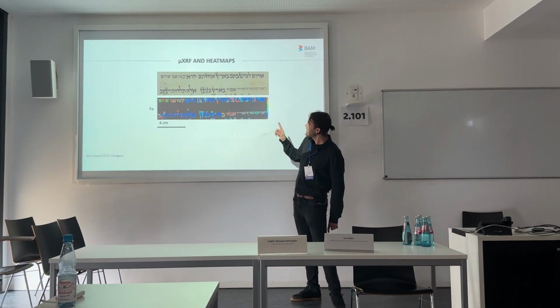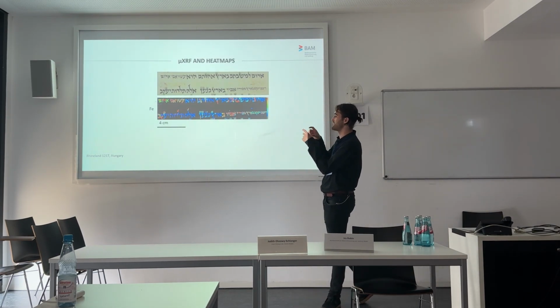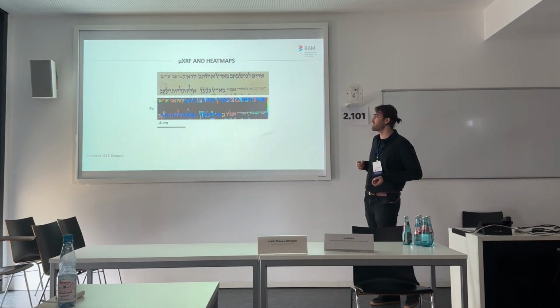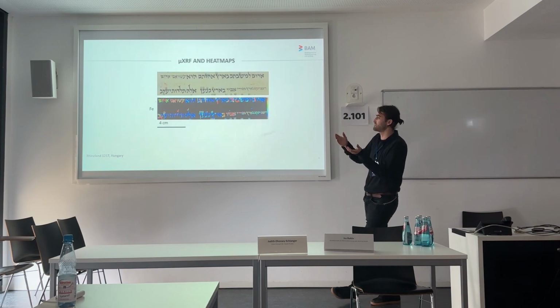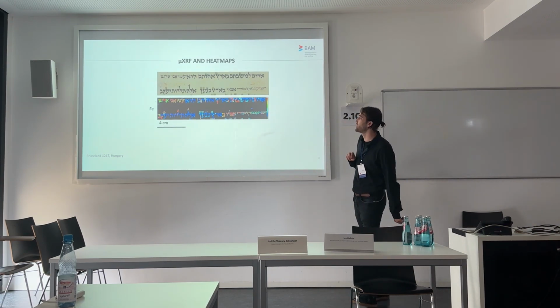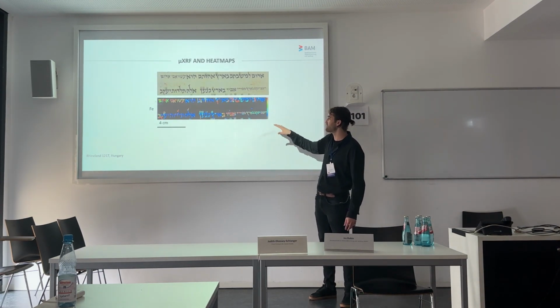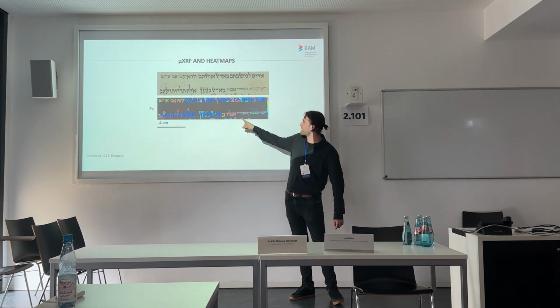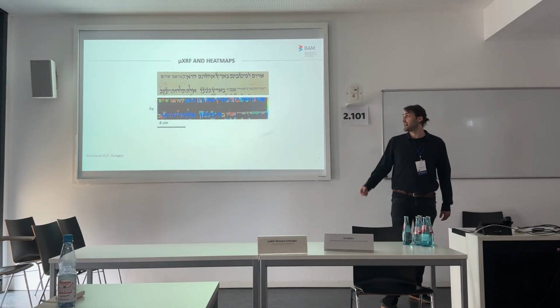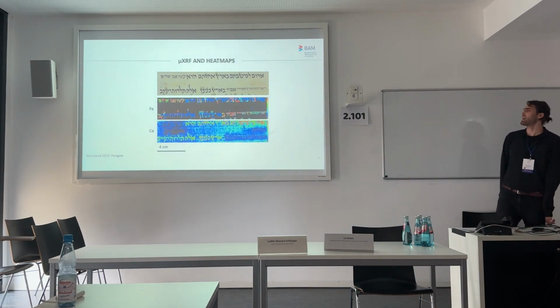portions of text. In the bottom, we see that at the end of the line, the intensity of the signal clearly corresponds with the fact that it was added later to the original text, which is expressed here in this dark red color. We also see that similarly crowns were added, and also this fragment in the lower line was definitely added. Let us move to the heat map of calcium to see what happened here.